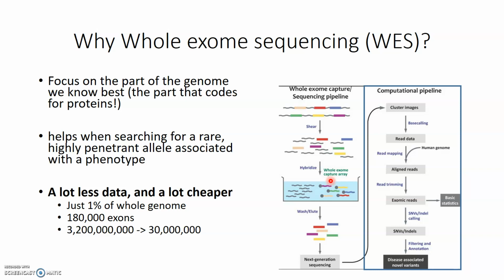But you can see from a computational perspective that nothing really changes for us, right? So the NGS instrument still delivers FASTQ files. We're still manipulating those FASTQ files, which is the large text-based file that's just a huge listing of all of our short sequences. We're going to align those reads to the reference that was developed during the Human Genome Project.